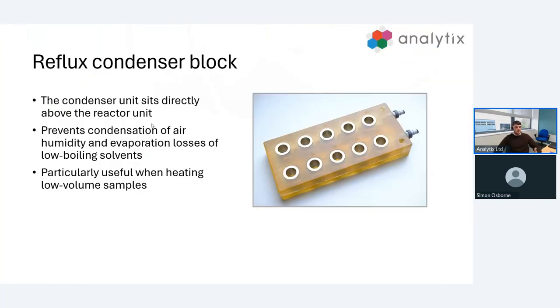Our most popular accessory and often comes with the system is the reflux condenser block. This unit sits directly above our reaction module. Simply we're fitting the vials through this and then into the reaction module. You can see an inlet and outlet for our chiller or coolant line. This is just cooling the top bit of our vials. What this does is it prevents condensation of air humidity and prevents evaporation losses of low boiling point solvents. It's particularly useful if you're using very low volume samples. You don't want to lose this all to the vapor phase.